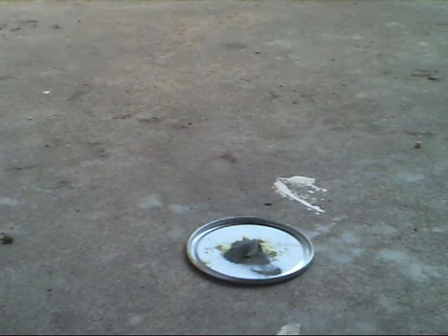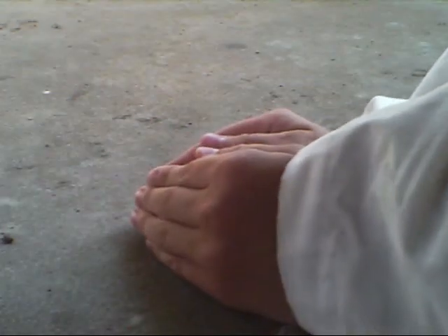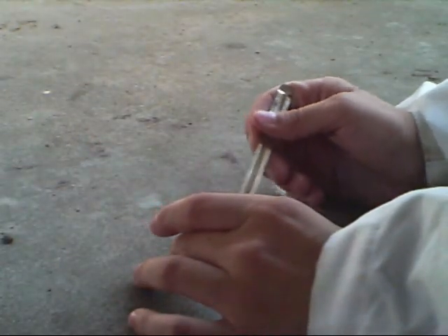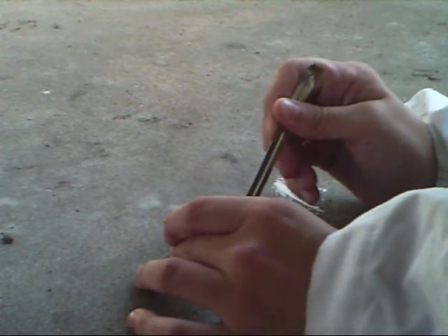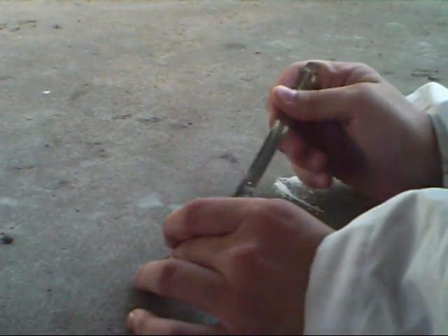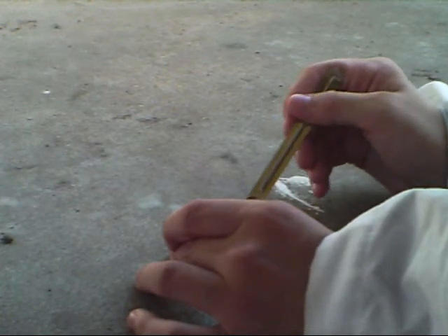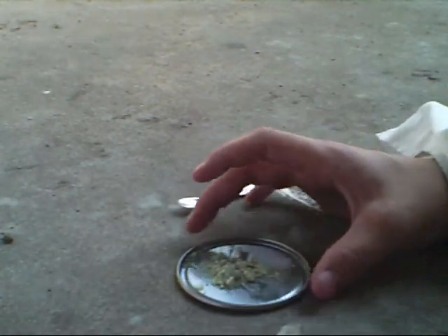Now it's important to mix this very well. You take it and you mix it up. You want to get the very big chunks of sulfur ground up and mixed in with it. Now as you can see, it's all mixed up.